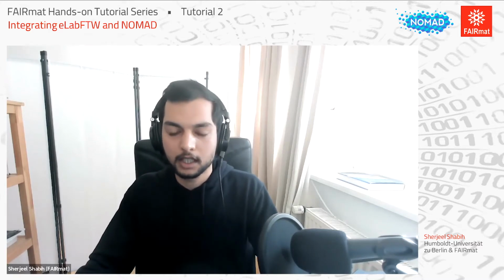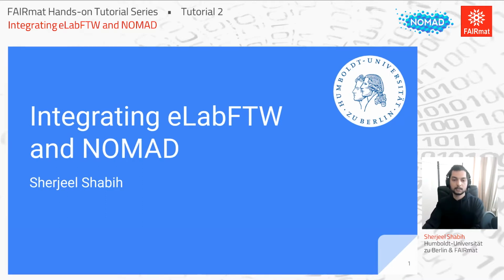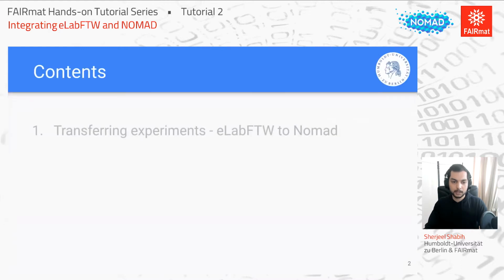And for a year and a half approximately, I've been working with eLabFTW and trying to see how it fits our lab's needs. So I prepared this small presentation, and this is where I'll talk about how one could integrate eLabFTW and NOMAD. So the contents of this talk would be first, how you could transfer experiments from eLabFTW to NOMAD, in case you already have an installation and you would like to migrate all that data.